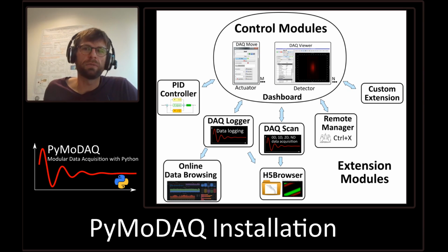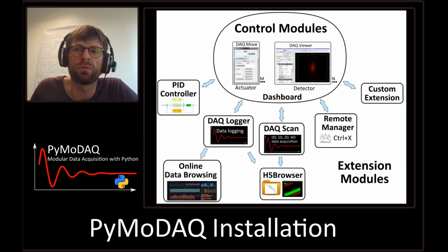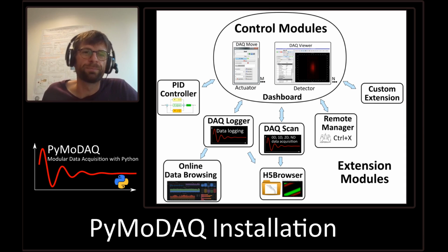I'll remind you that PyMoDAQ is a set of modules and user interface modules to control various instruments in your experimental setups. Those are the so-called control modules. And then extensions can interact with all those control modules and perform various things such as data acquisition, data logging, and many other things that are just limited by your imagination.